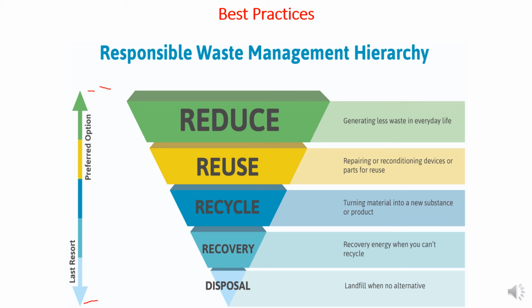So the lowest one is disposal. Whenever we have certain wastage, we should go for disposal. Where should we dispose of it? Sometimes if no other facility is available, then of course landfill happens, like dumping into a particular place, for example going into the mountains, throwing it there and then covering it with soil. And the second one is we can dispose of our waste and then recover from it, we can get energy from that disposal. So this is the second category.